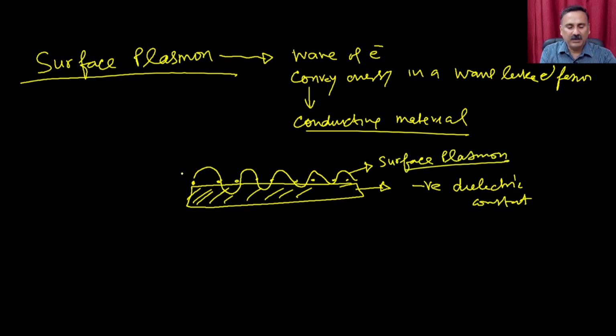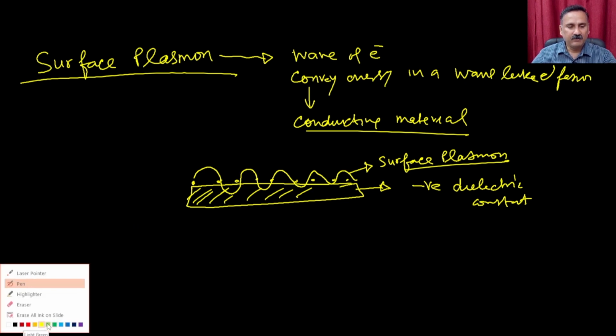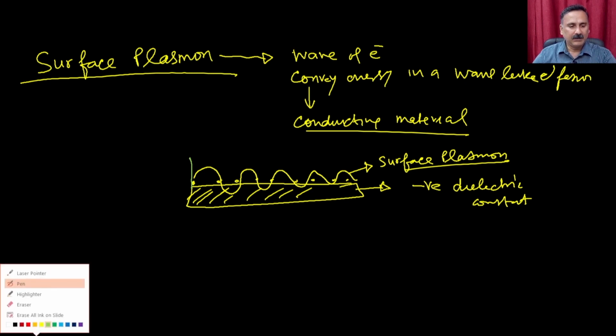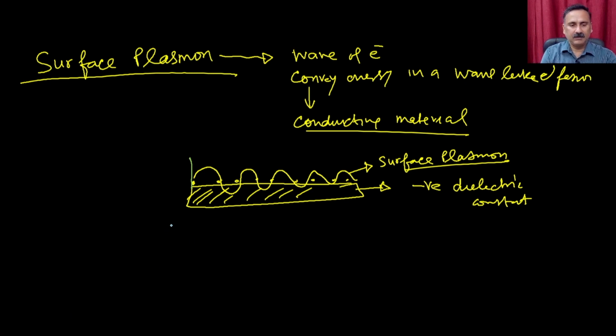But it doesn't happen until there is some kind of modification in the top surface. If you have two gold particles one next to another, then no surface plasmon will be formed. How it forms is that you have the water molecule. If you keep the water molecule in front of this particular metal surface, what will happen is that the gold, the water or buffer, for example, right?